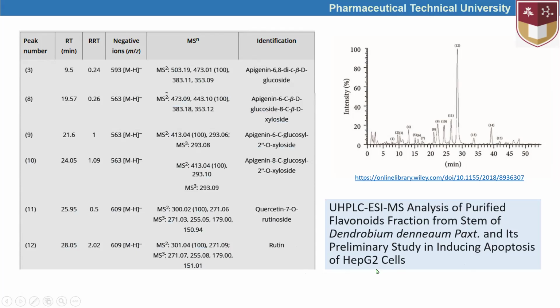So based on this kind of approaches, it is possible to identify different components in extracts. So then the effects of those extracts on different cancer cells could be studied.